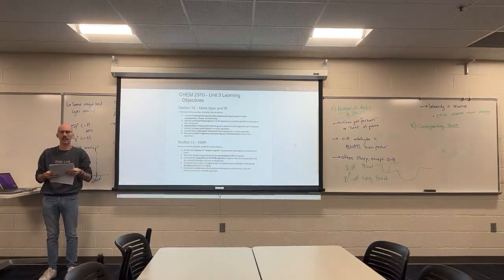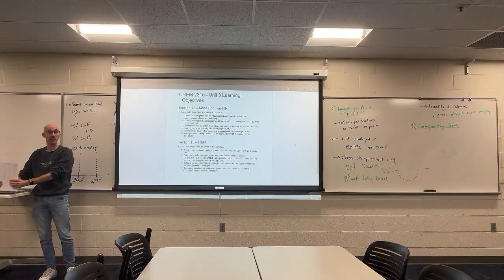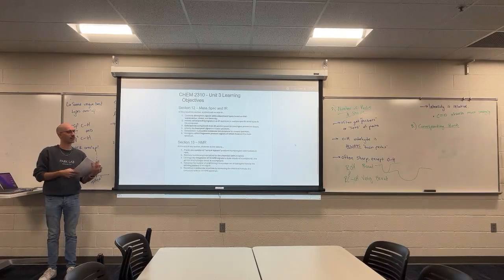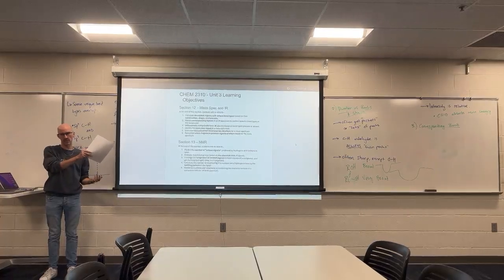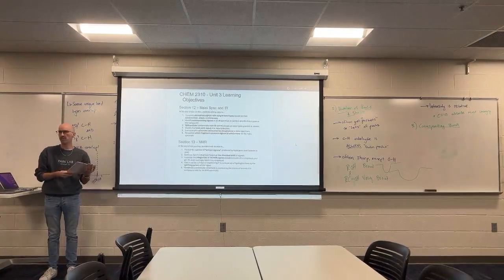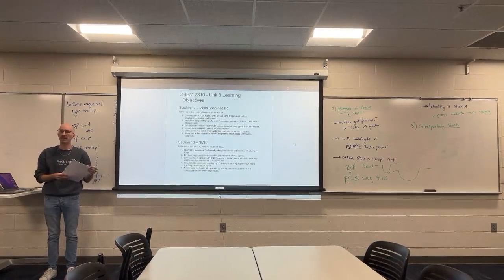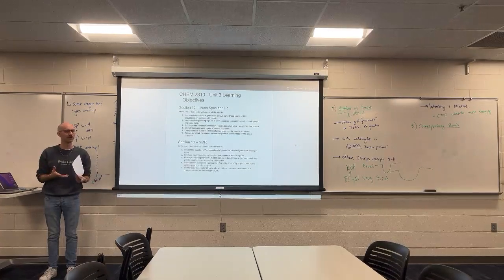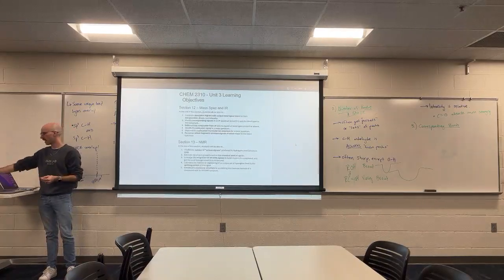But correlating and corresponding are different, and that's why I don't think I've heard anybody else describe this section quite like this, corresponding peaks. But for me, it's an obvious part of IR that doesn't feel obvious until you lay it out. And I hope that you guys will see that this feels obvious as well.